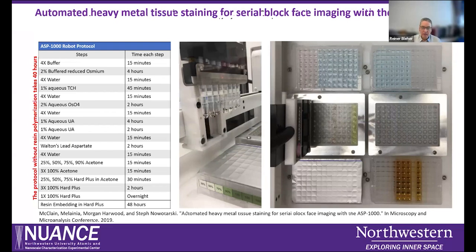And here we can also see some sealed capsules. We have plastic seals for aqueous solutions, and we have aluminum heat seals for solutions that contain solvents that easily evaporate.